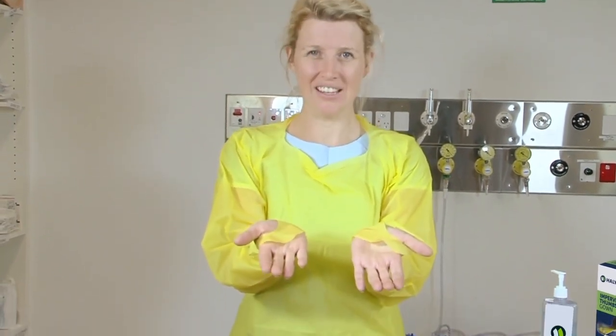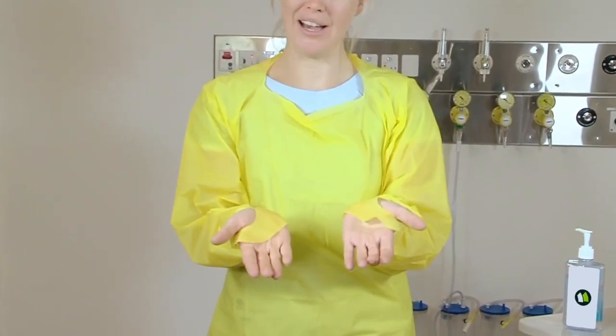Remember, there are different designs available. An open-backed gown allows for greater flexibility and a little bit more comfort. The one I'm demonstrating today — a thumbs-up gown — prevents the sleeves from riding up.